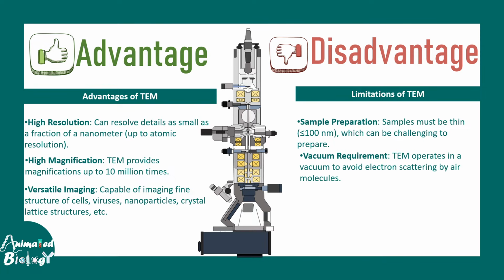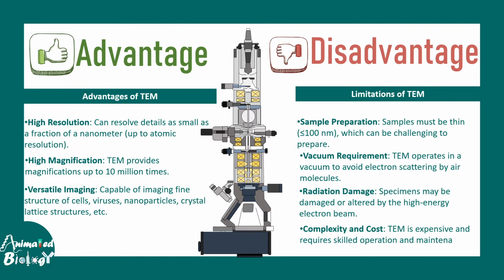A vacuum chamber has to be created because otherwise the electron beam would scatter. Radiation damage is always a hazardous risk in this kind of technique. Complexity and cost-wise, it's not really economic.